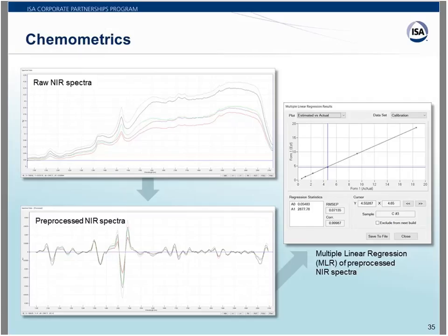So from this section of the webinar, I will be talking to you about how to extract real-time information on the manufacturing processes using inline optical spectrometers. So this session will help you to understand how to analyze the moisture content based on the spectral data acquired during the manufacturing process, although other types of measurements can also be investigated.